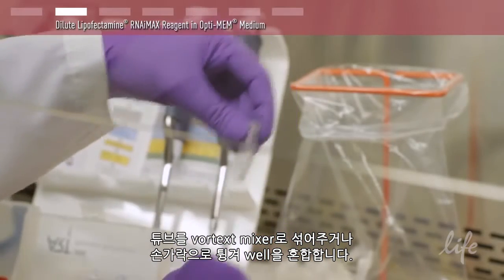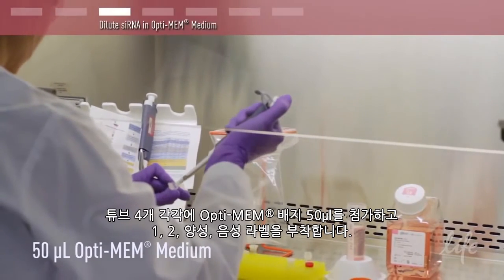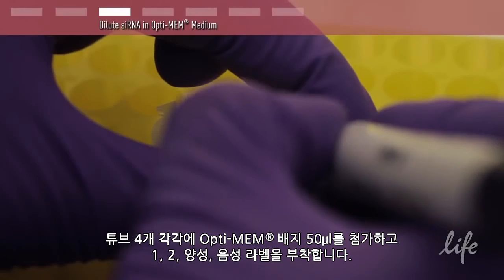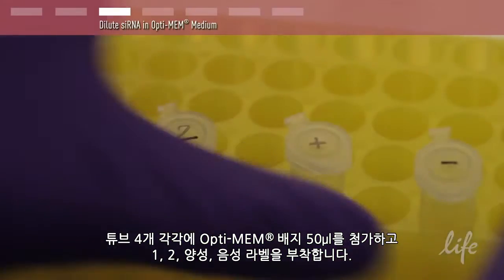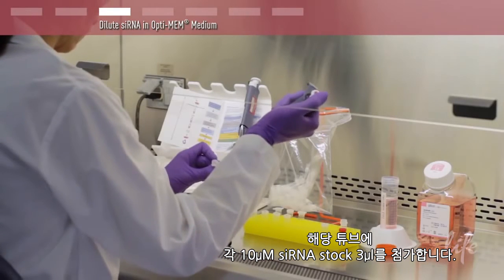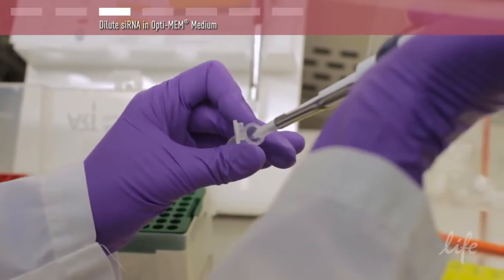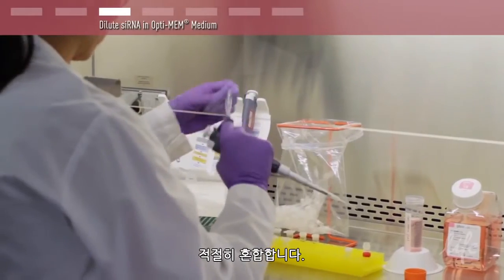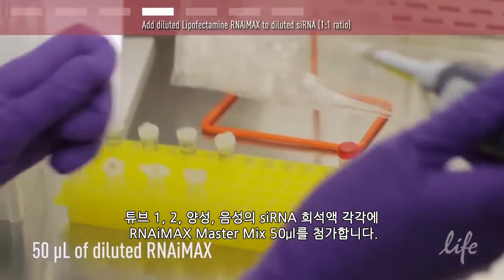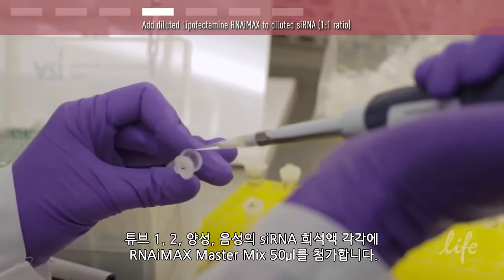Mix well by vortexing or flicking the tube. Add 50 microliters of Optimem medium into each of four tubes and label them 1, 2, positive, and negative. Add 3 microliters of each 10 micromolar siRNA stock to its corresponding tube. Mix well. Add 50 microliters of the RNA IMAX master mix to each of the siRNA dilutions in tubes 1, 2, positive, and negative.